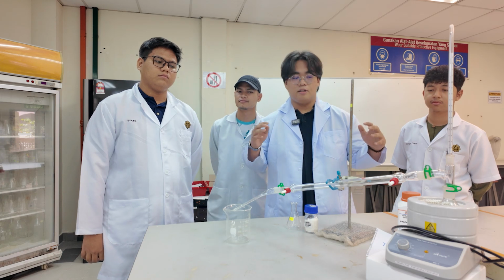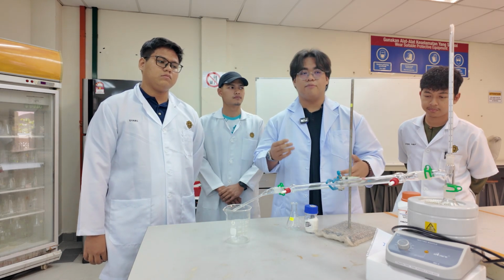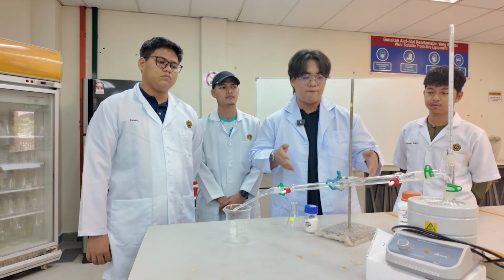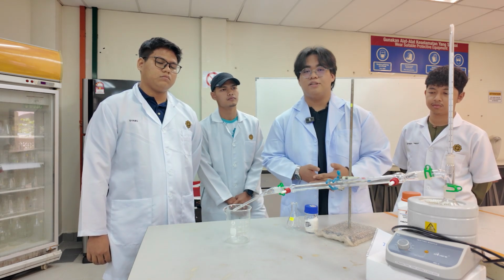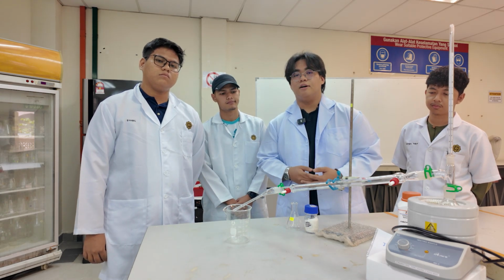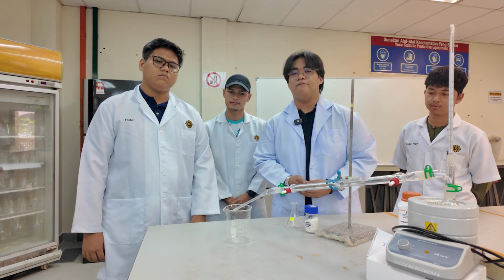The overall experiment, we want to separate the base from the salt, hydrochloride salt form. So the problem statement for the distillation process is we want to separate the base compound from the dichloromethane solution, that is an organic solvent.